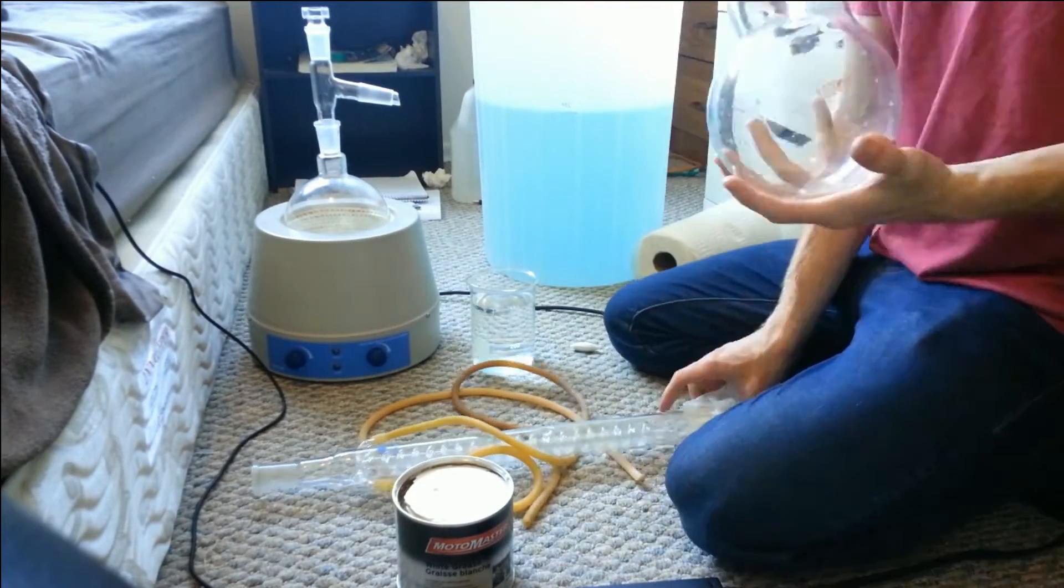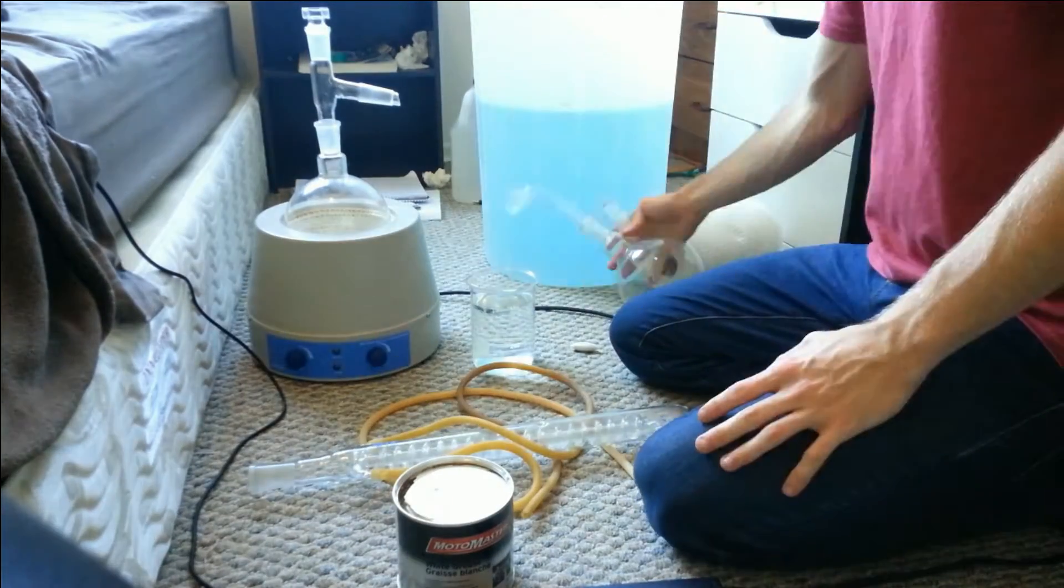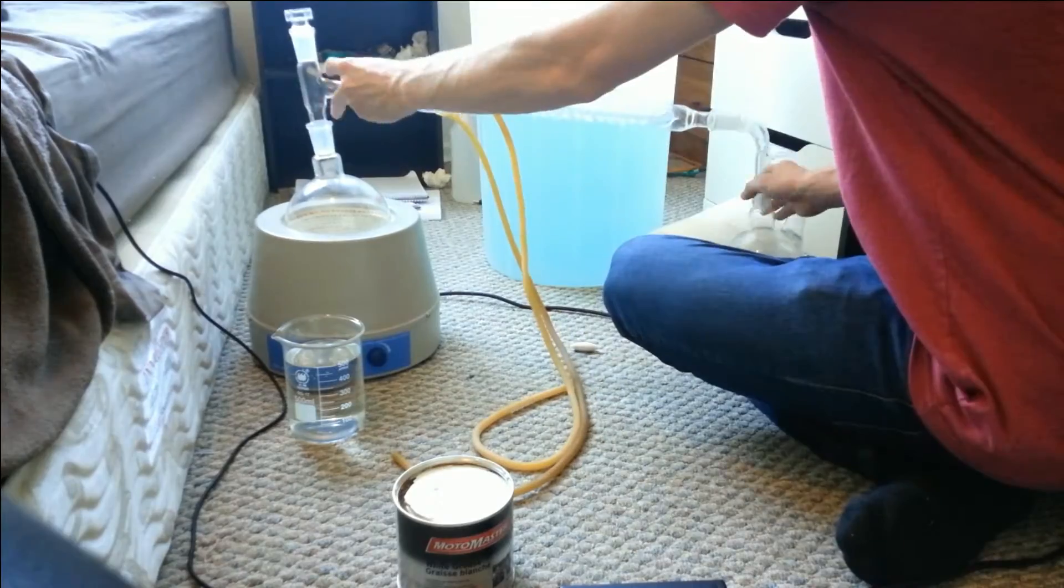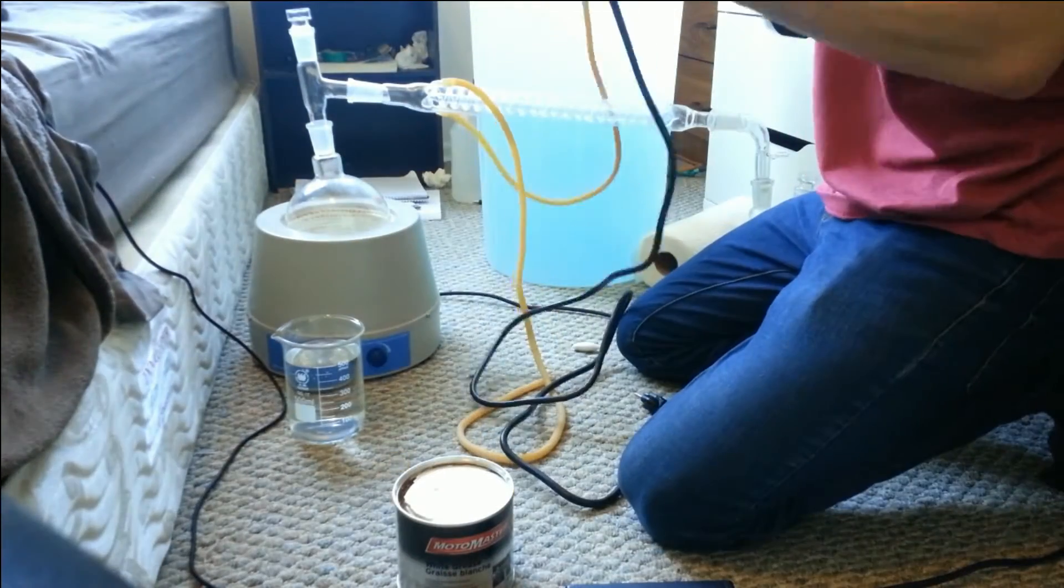The stuff you want to evaporate is going to go into the heating mantle, into that round bottom flask. The other one, put away from it where you want to collect the solution you're boiling away.